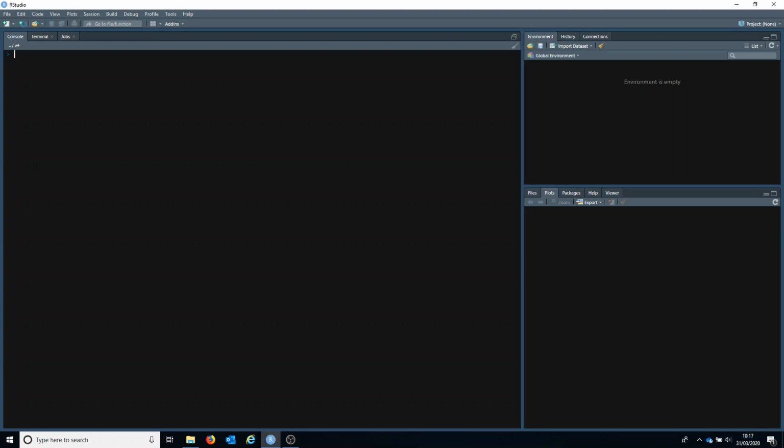This tutorial is going to go through some new features in the powdR package. So I'm going to load the package, and then I'm going to run the web application using run_powdR. Then it should open in your default web browser. I use Firefox, which tends to be fine, so I'd recommend that.